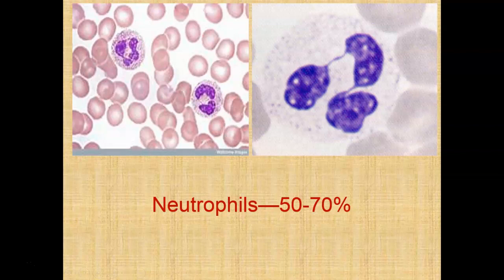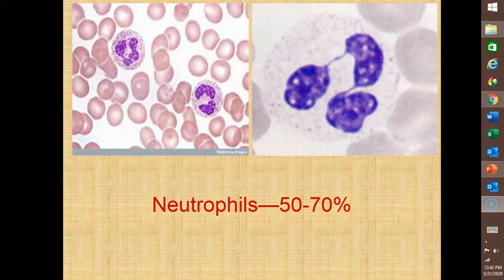Neutrophils are the most abundant of all leukocytes, making up 50 to 70% of your leukocyte count. Here you can see two neutrophils — they have a very pale-staining cytoplasm and dark, multi-lobed nuclei, typically between two to five lobes depending on how the cell was positioned when the blood smear was made. Look how pale the cytoplasm is. Neutrophils are your bacteria slayers, the first responders; they fight pathogens first and call in backup if they can't handle it.